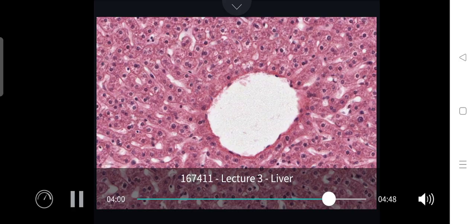The canaliculi actually are very narrow channels between every 2 adjacent hepatocytes and do not have any other wall of their own. Again, they are too tiny to resolve here, but you can imagine where they would be located.